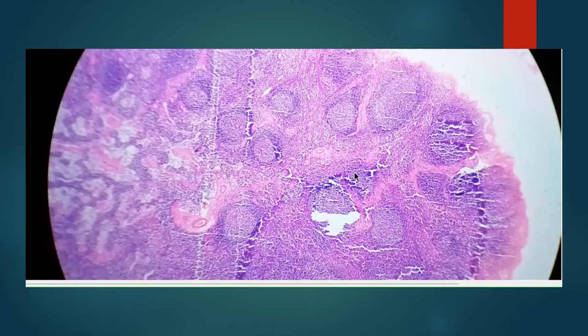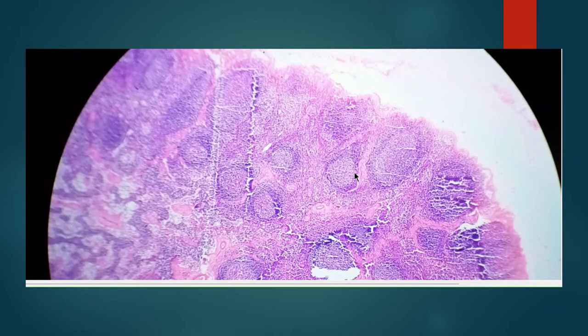Now, we have come to another system called the lymphatic system. It is also a bit complicated to identify. Now, I will tell you an easy way to identify and differentiate all four lymphatic organs. In the lymphatic system, we are going to see lymph node, spleen, thymus, and the palatine tonsil. So this is nothing but your lymph node. How to identify the lymph node?